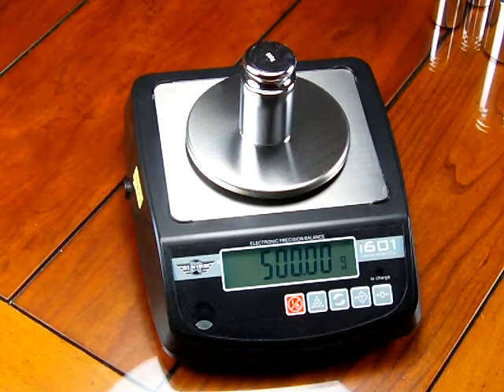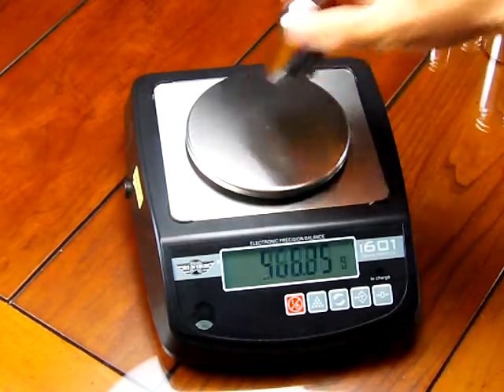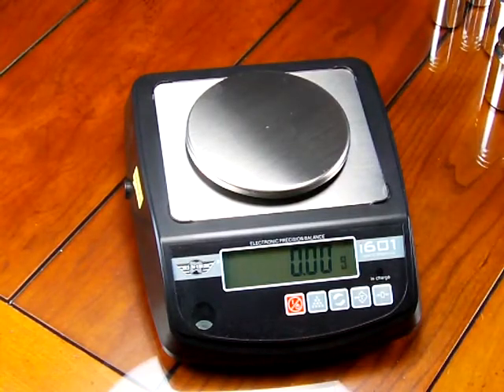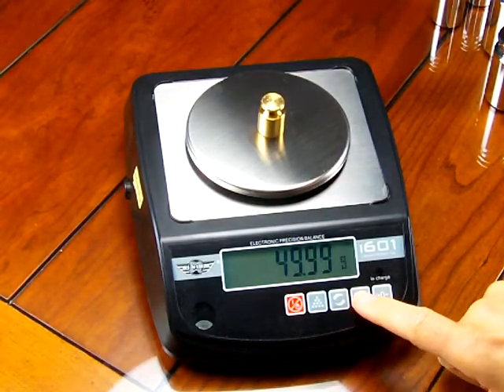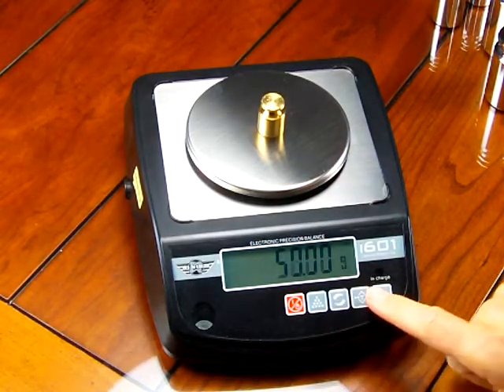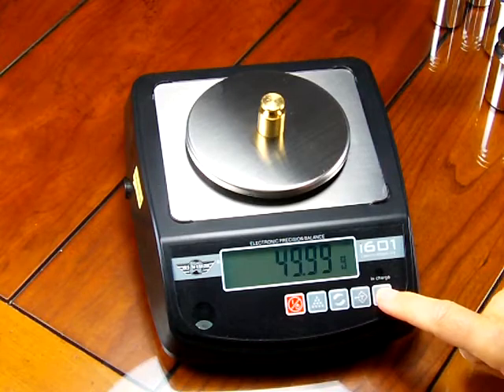The scale also has the parts counting mode. So if you wanted to count parts, it also has the ability to tare and zero. So if we were to put on, we'll say it's a 50 gram, I could tare it out.